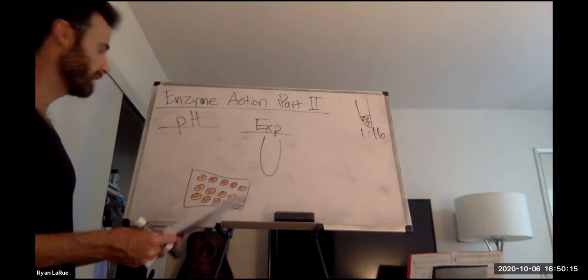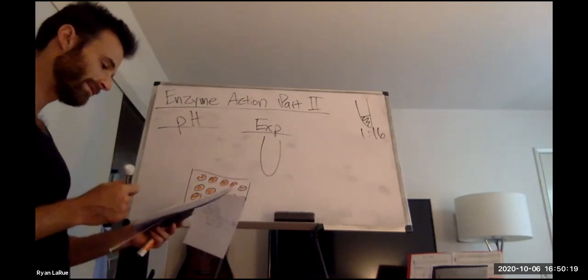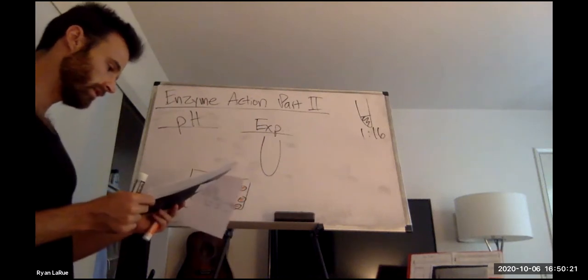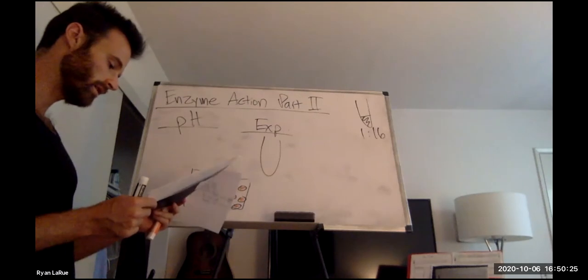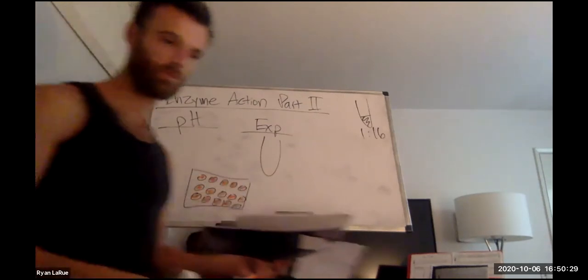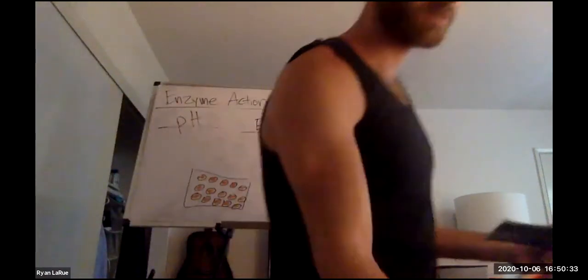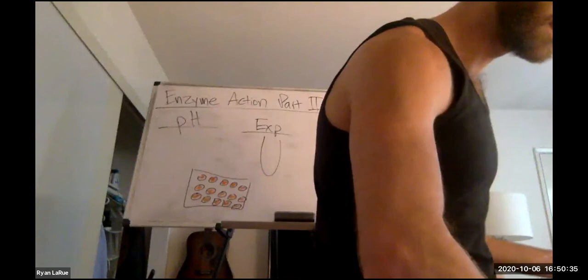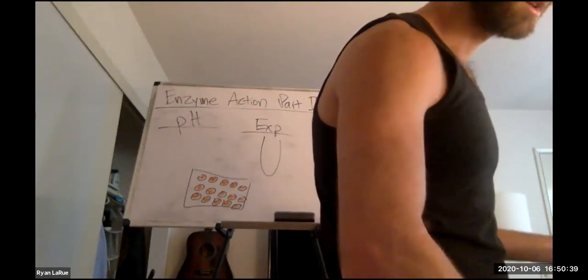Okay, so for pH, she has pH 3, pH 5, 6, 9, and 11.